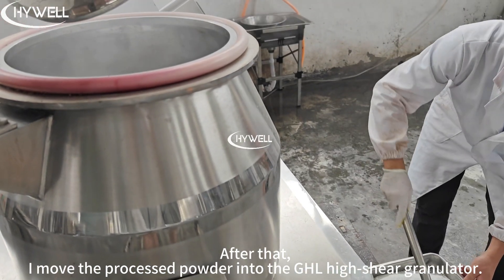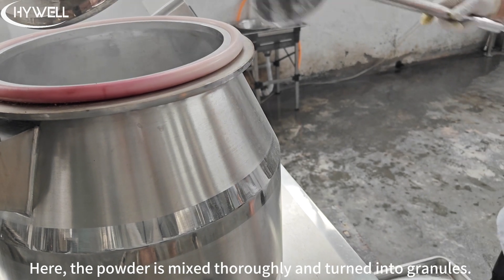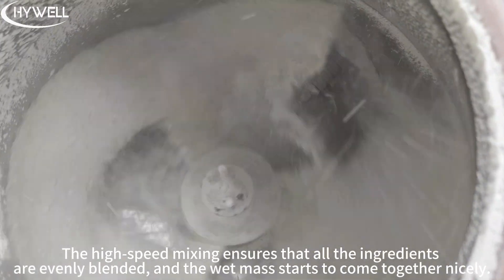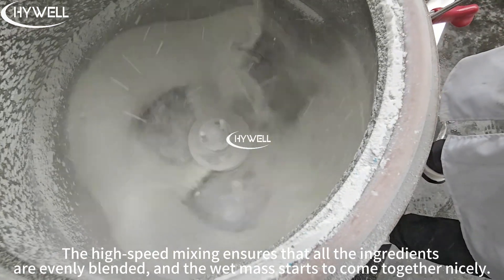After that, I move the processed powder into the GHL high shear granulator. Here, the powder is mixed thoroughly and turned into granules. The high-speed mixing ensures that all the ingredients are evenly blended and the wet mass starts to come together nicely.